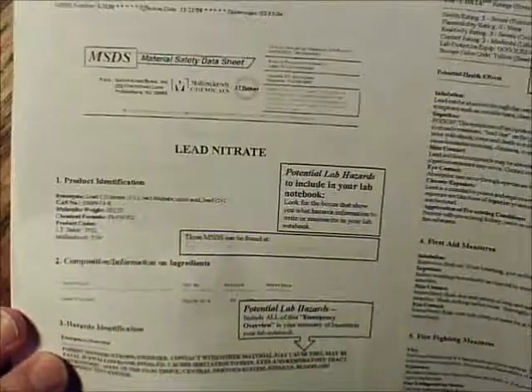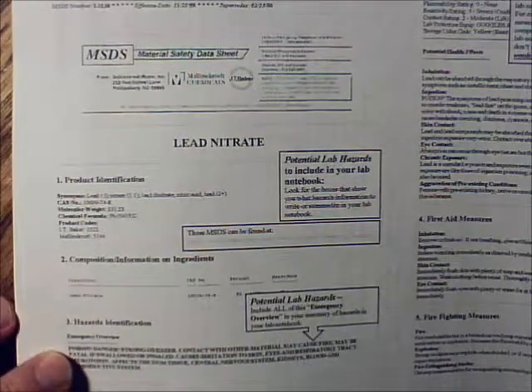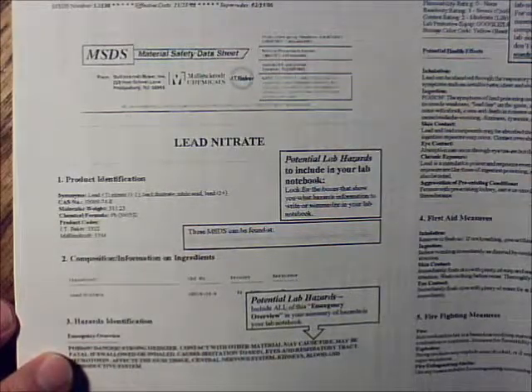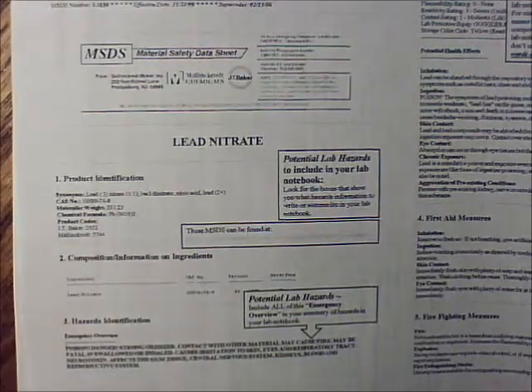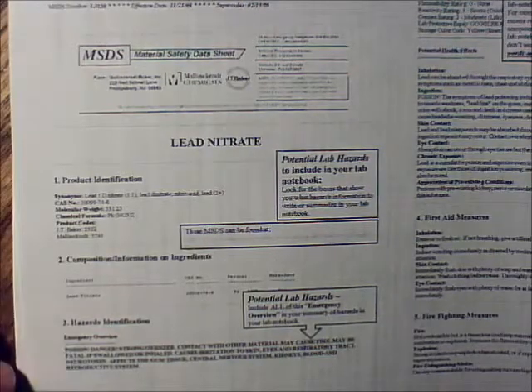All right, so this is an MSDS. They will soon be called simply SDSs, and these are for every chemical there is. There's an SDS that explains the potential hazards of that chemical.